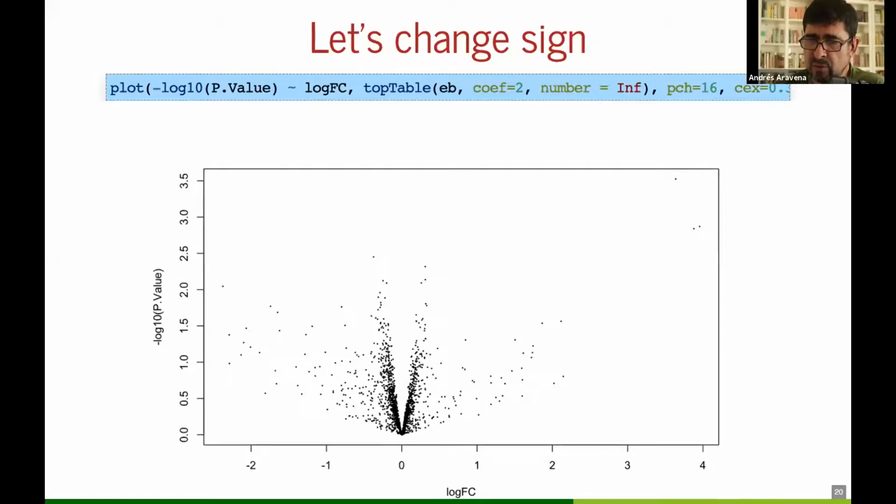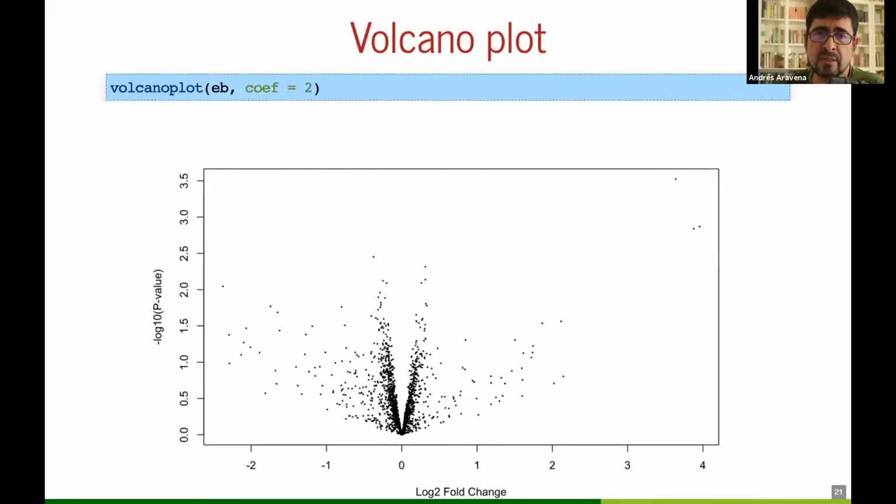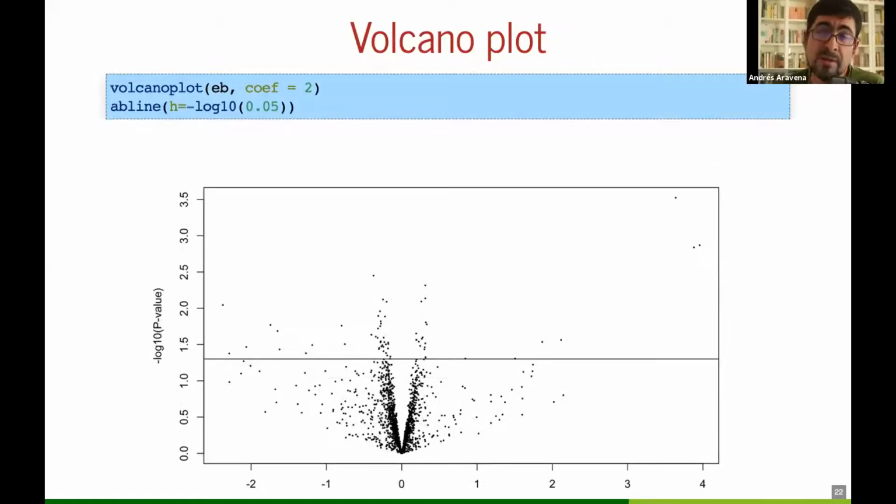very few or maybe 0 genes that crossed the threshold, and we did a couple of things. One thing that we did, but it's already done here, is that instead of using all the microarray, we used only the oligos corresponding to mouse, because this is a big platform and includes microRNA for human and for yeast, I don't know, many other organisms.